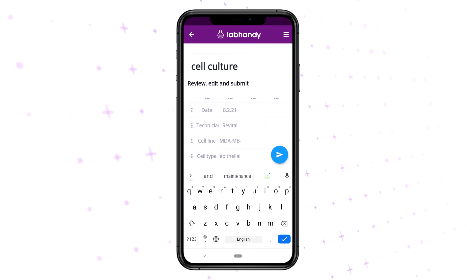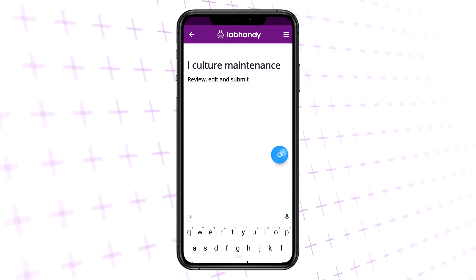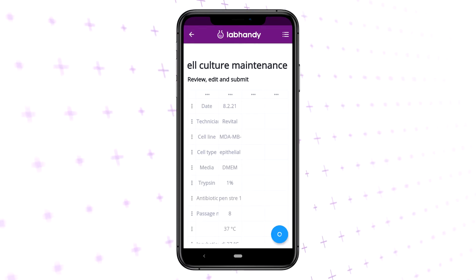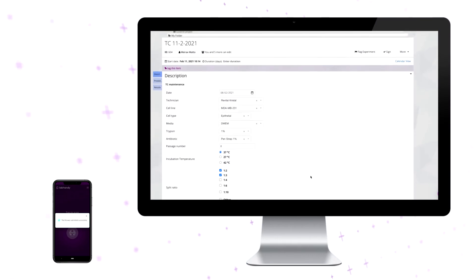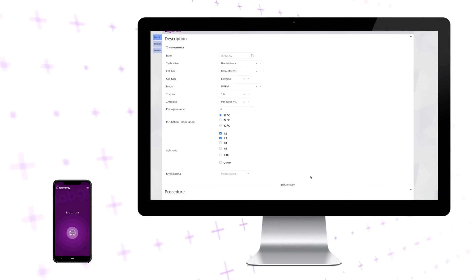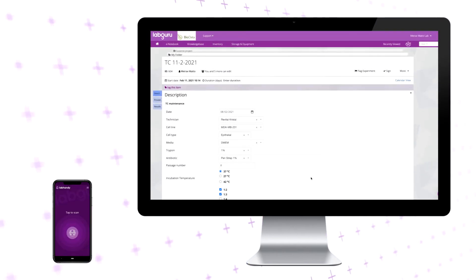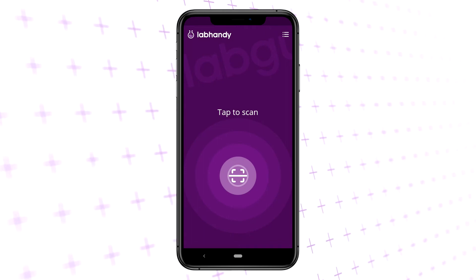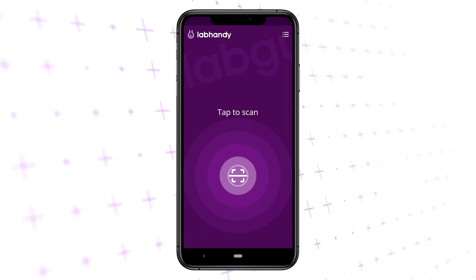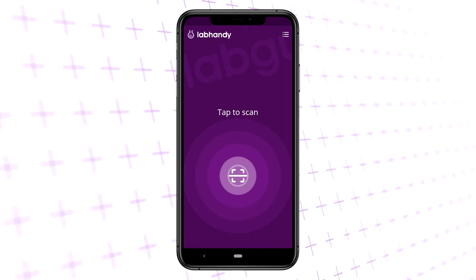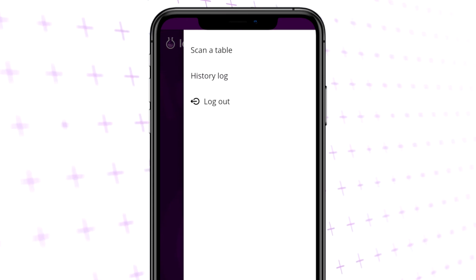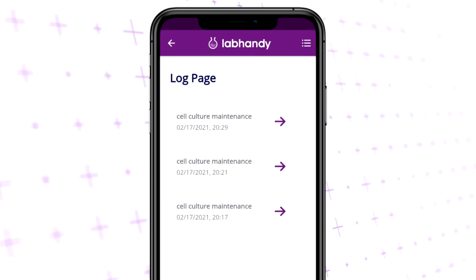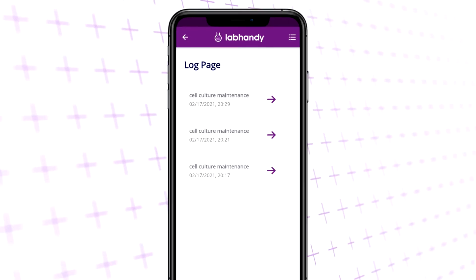The table will be automatically uploaded to LabGuru according to the table ID. Once uploaded, you will be able to see the table in the relevant experiment. You can always see in the app the history log of all the tables you uploaded in the past. Click on the menu button to see the history log and choose the file you want to view.